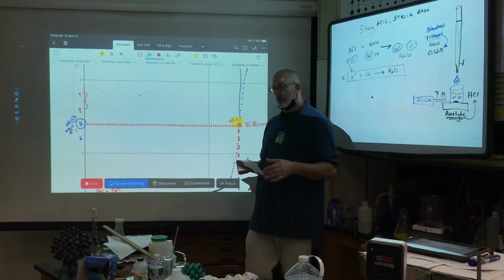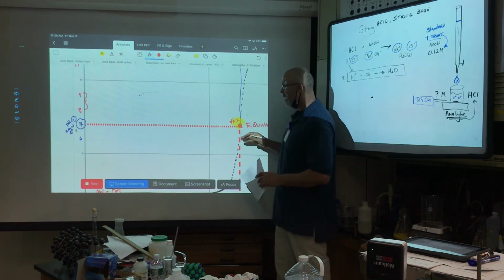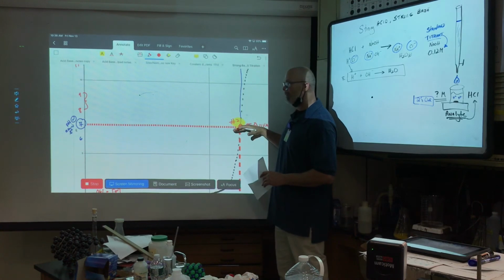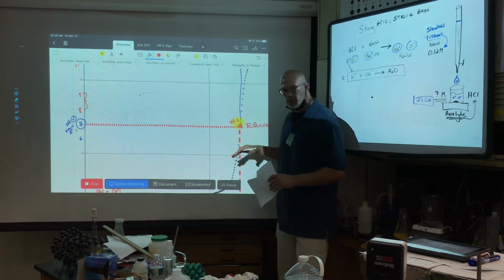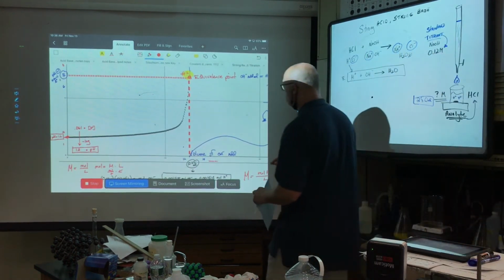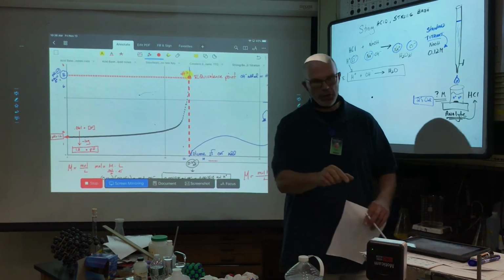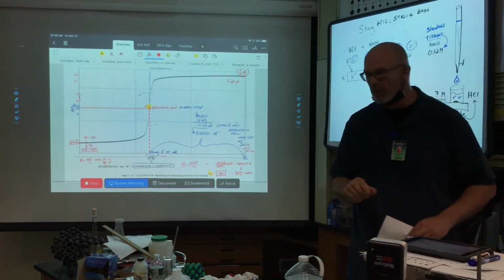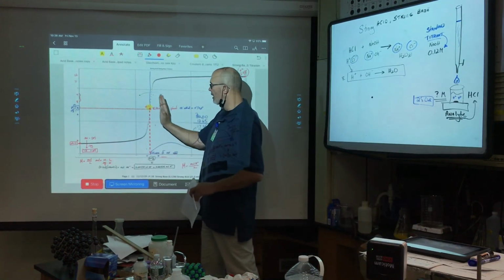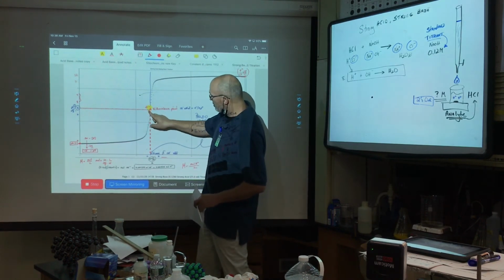We definitely do see signs in the beaker of it turning that fuchsia color earlier. And when we do a titration with just an indicator, it's important you understand we don't have to use a pH probe to get the equivalence. We can approximate the equivalence, because what does the equivalence point give us? The equivalence point gives us the exact volume that's added. But because the curve of the titration is asymptotic, almost a straight line near the equivalence point, for reasons we've explained, this line is almost straight up.